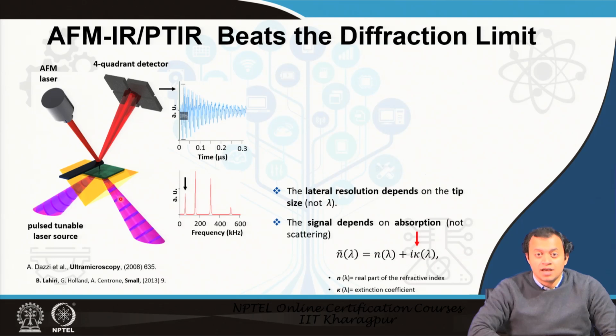If the pulse laser has been absorbed, I know the wavelength of that pulse. If I know the wavelength of that pulse, I know from my FTIR database what molecule absorbs that wavelength. From that, I am identifying what molecule is present in that specific area where it has received the kick.